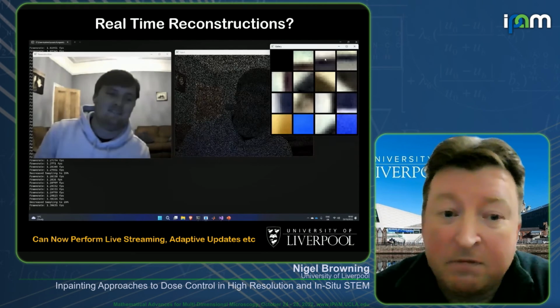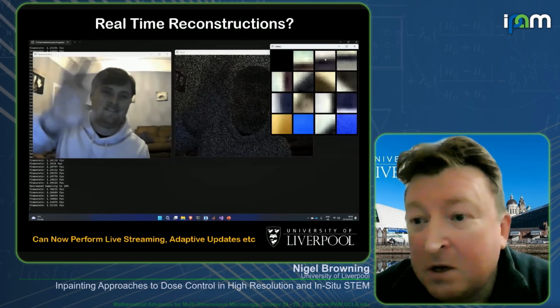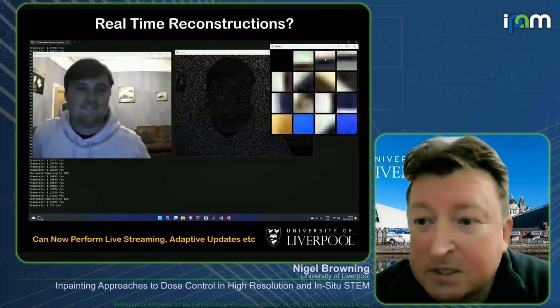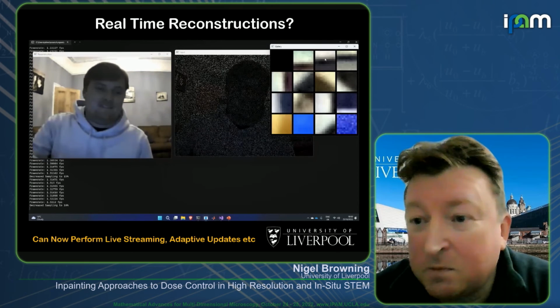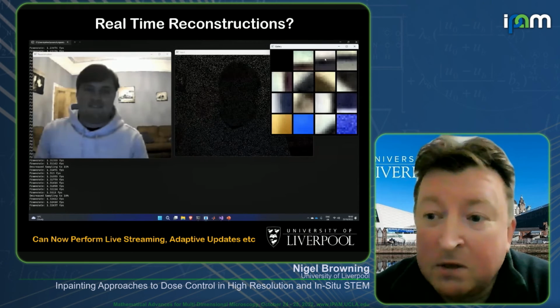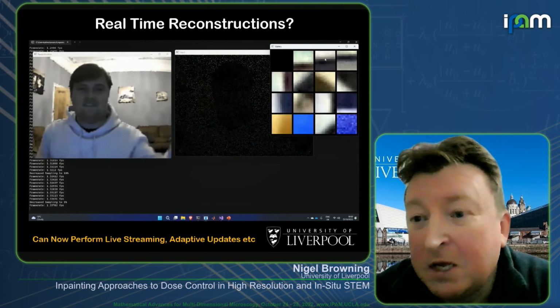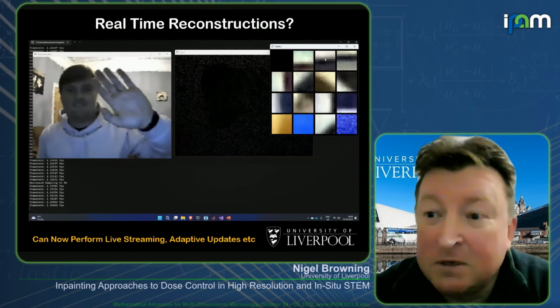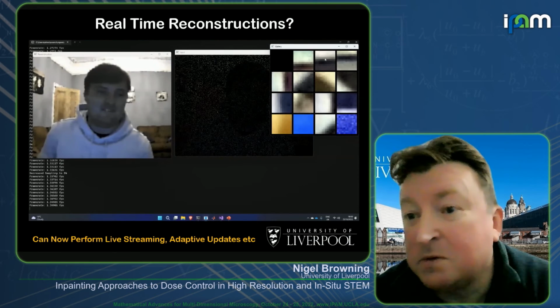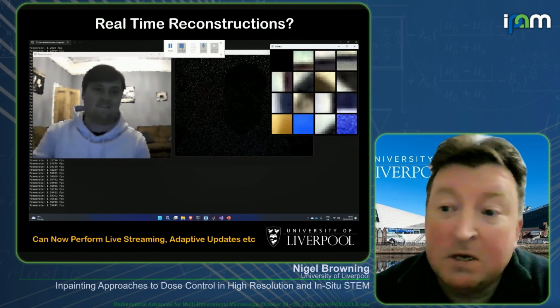The idea about being faster on the reconstruction is, let's say, again, we use 10% of the pixels. So our first image takes us 1/10 of a second. If it takes 1/10 of a second to reconstruct, we can then use that reconstruction to position the beam for the second set of pixels. And so again, we can have 20% of the time we can target specific pixels of areas where you think there's missing information. And all of that can be done in real time.